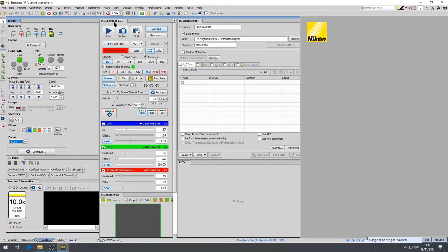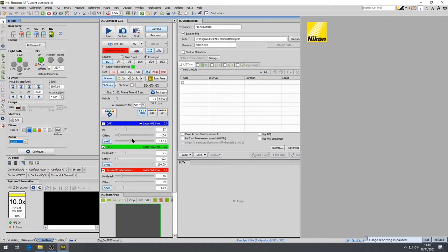The A1 plus compact GUI within this panel contains all the necessary controls for laser scanning confocal such as lasers to use, laser powers and also set the offset and the PMT gain for each selected channel.